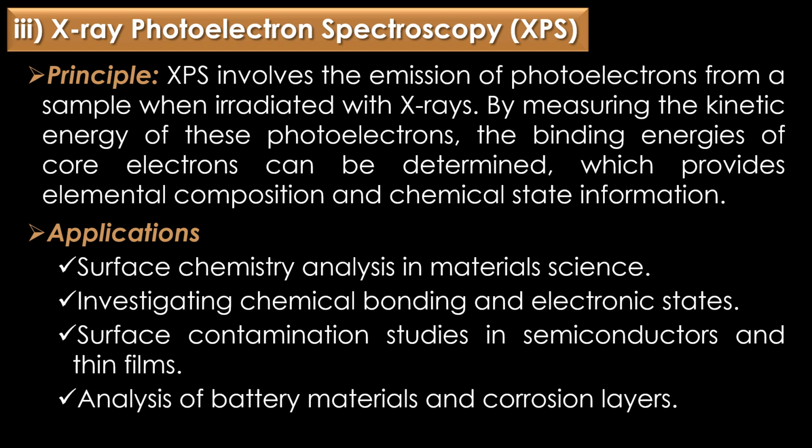Applications of X-ray photoelectron spectroscopy. The applications of XPS include surface chemistry analysis in material science, investigating chemical bonding and electronic states, surface contamination studies in semiconductors and thin films, and analysis of battery materials and corrosion layers.